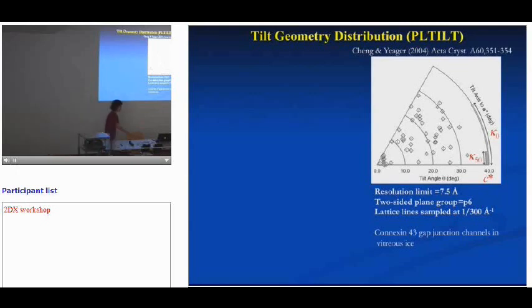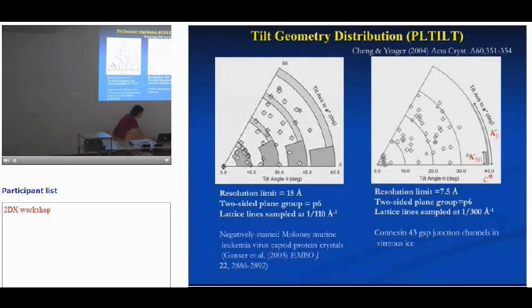And this number certainly changes with the resolution that you are seeking, as well as the thickness of your sample. So this is another example, of a virus capsid. It's in negative stain. It's very thin as well, just 110 used as the C value.